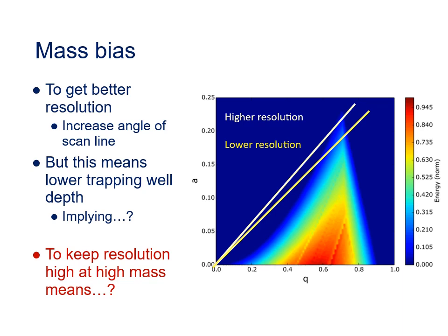But what if you need to have the isotopic peaks fully resolved for a high mass ion? What can you do then? Well, the answer is, of course, you increase the angle of the scanline so that you're in a narrower part of the tip of the stability diagram.